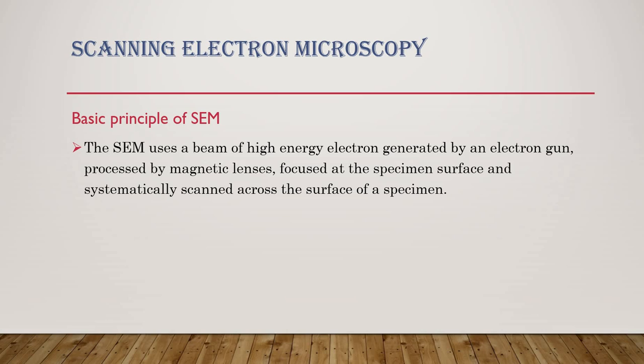Unlike the light in a light microscope, the electrons in a scanning electron microscope never form a real image of the sample. The image is in the form of a serial data stream, that is, it is an electronic image. It is a result of the beam probe illuminating the sample one point at a time in a rectangular scanning pattern, that is raster scanning pattern, with the strength of the signal generated from each point being a reflection of differences, for example topographical or compositional, in the sample.